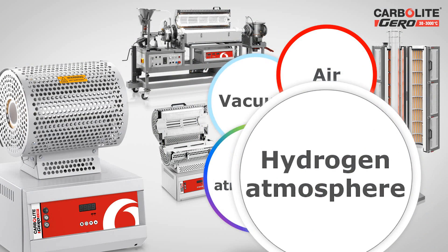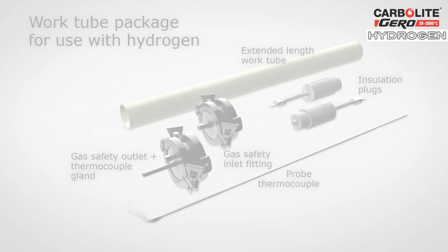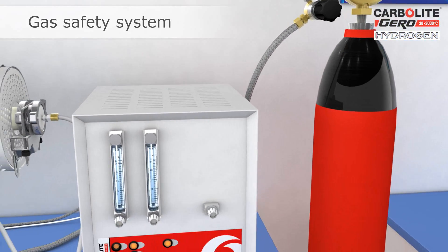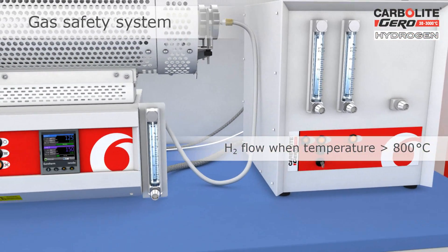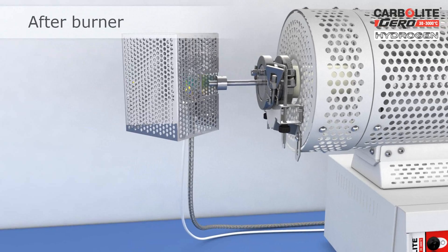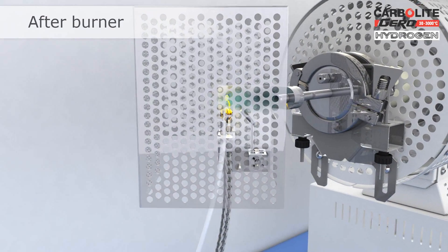For applications involving hydrogen, Carbolite Gero offers an additional gas safety system which can be attached to the tube furnace to safely control the gas flow. The gas safety system ensures nitrogen purge and only allows the hydrogen to flow when the furnace temperature is above its auto-ignition temperature. An afterburner ensures that unburned hydrogen is combusted as it exits the work tube assembly.